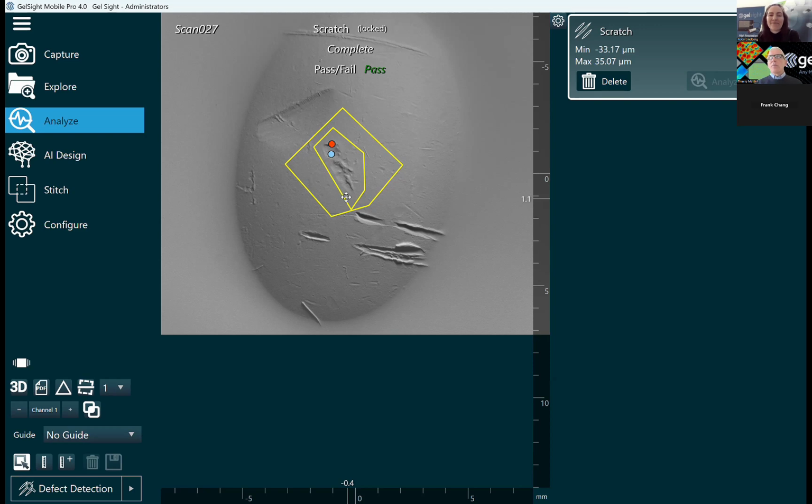Yeah, something very important to mention is that when you reconstruct a scratch, the scratch will look planar. For example, if you have a scratch on a very complex shape like a cylinder or a 3D shaped component, you will not be able to reproduce the mean shape of the component because the probe, when in contact with a part, doesn't know exactly in which orientation it is compared to the part. We are not able to measure the position of the probe in the reference of the part.